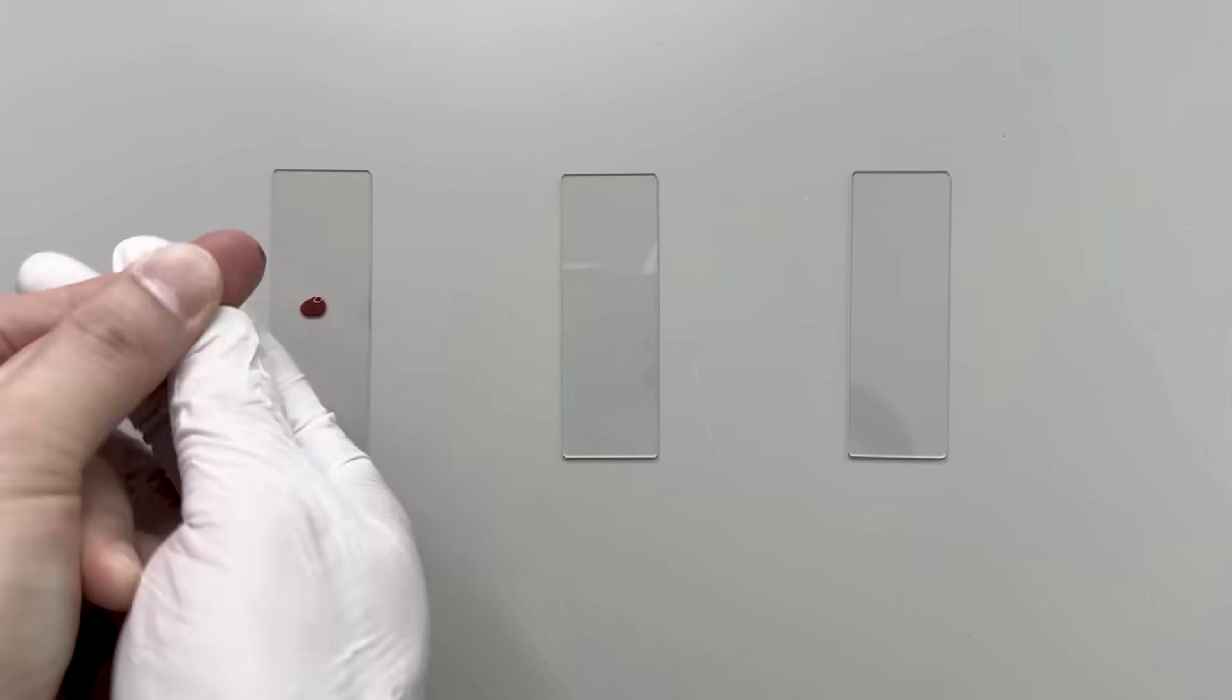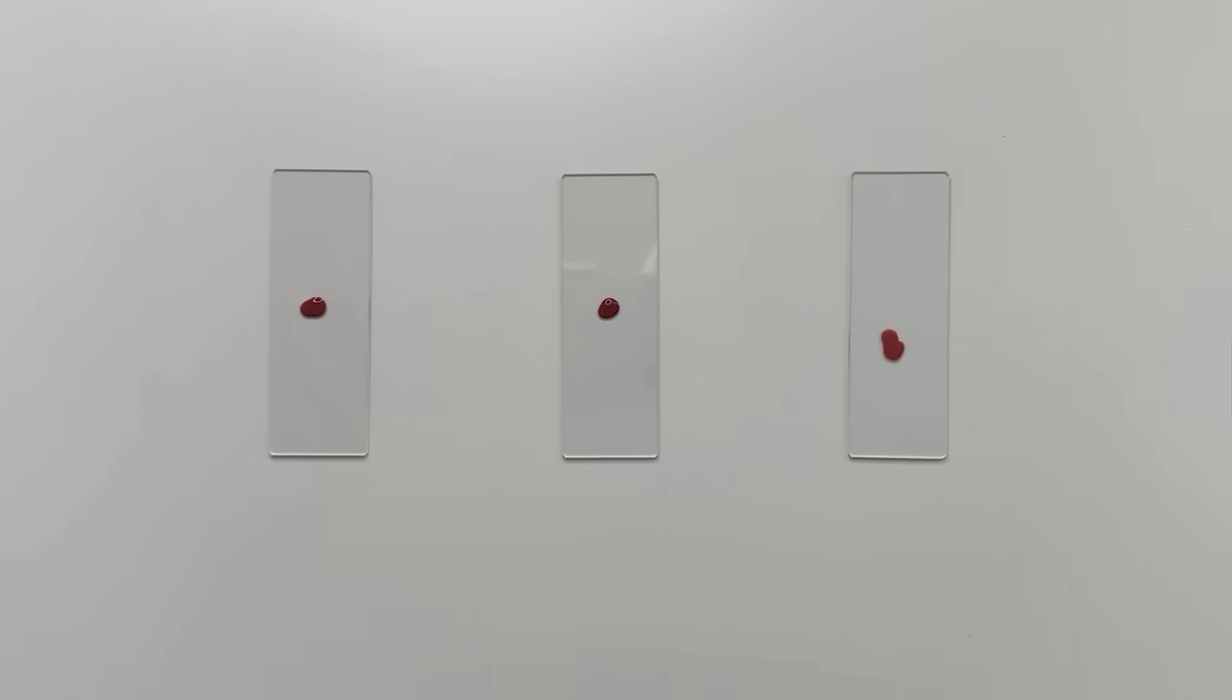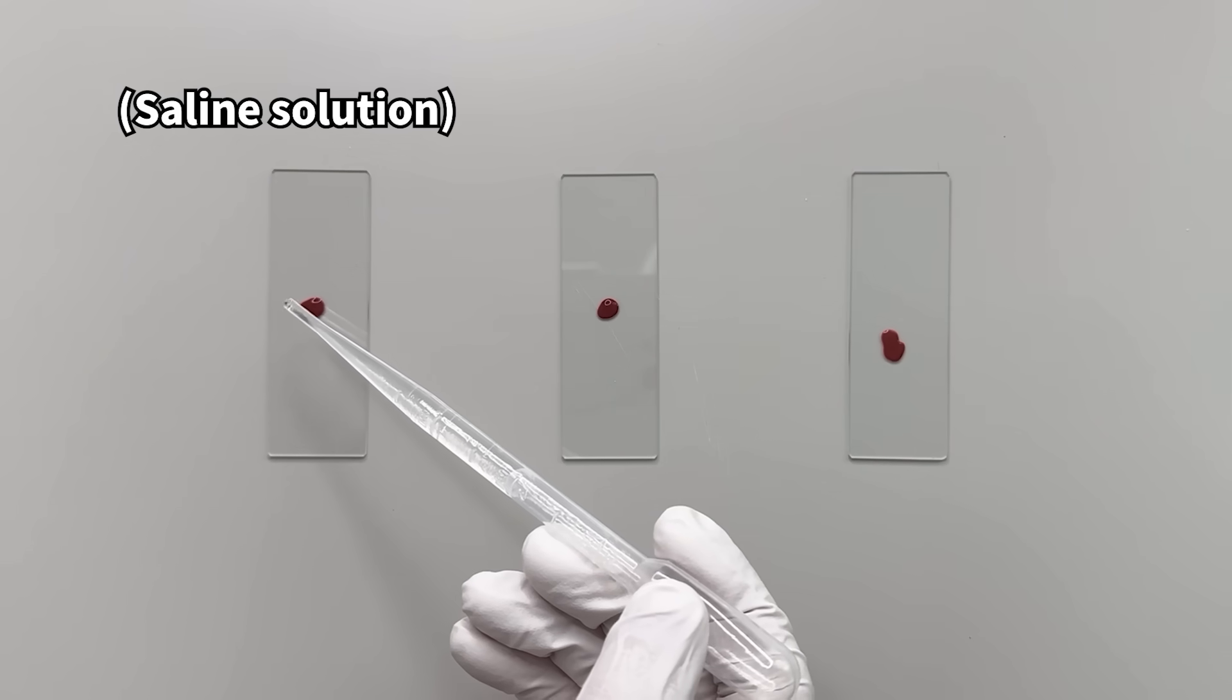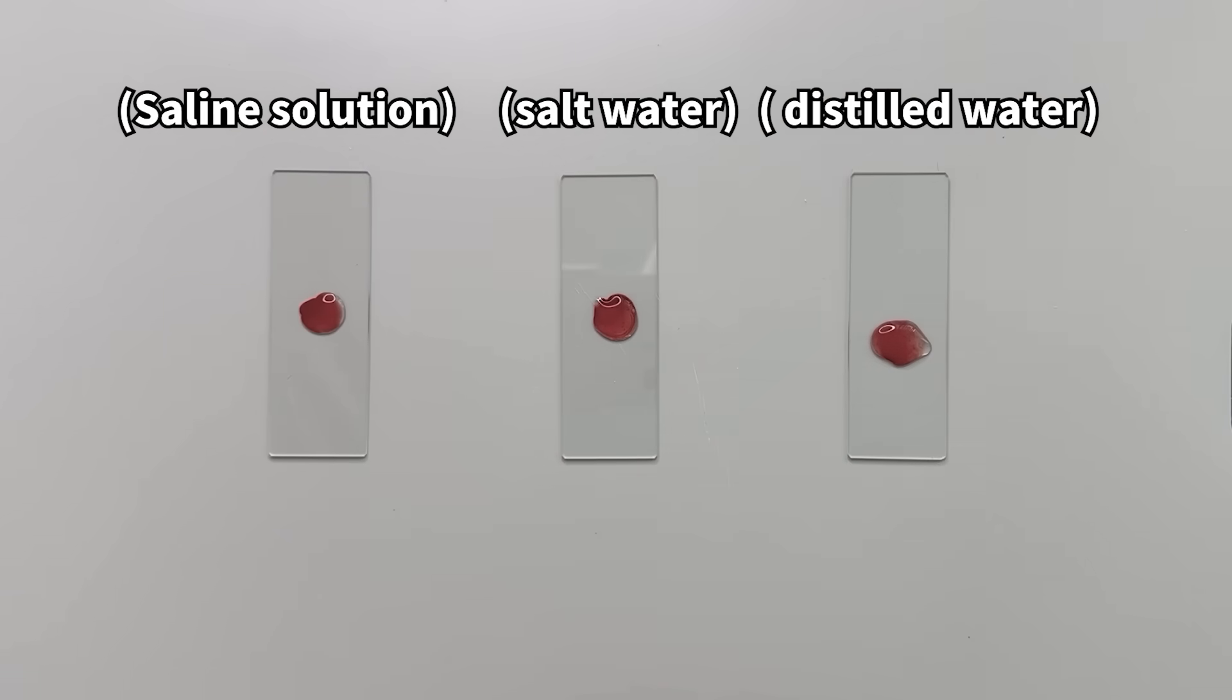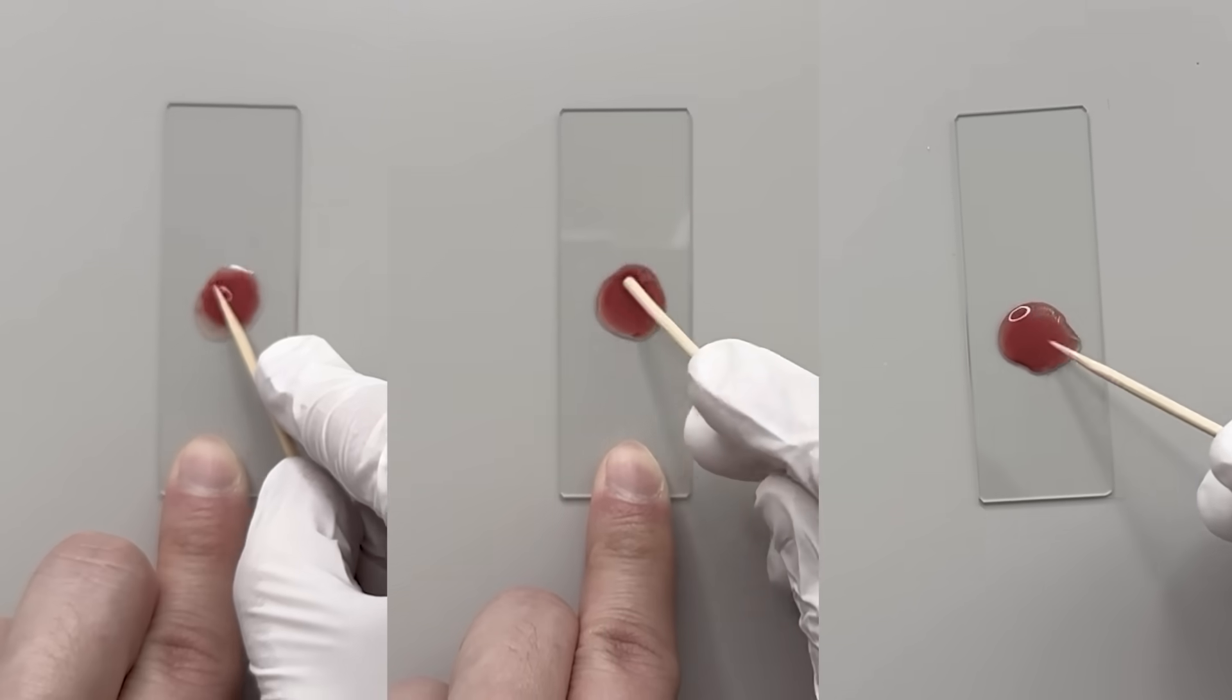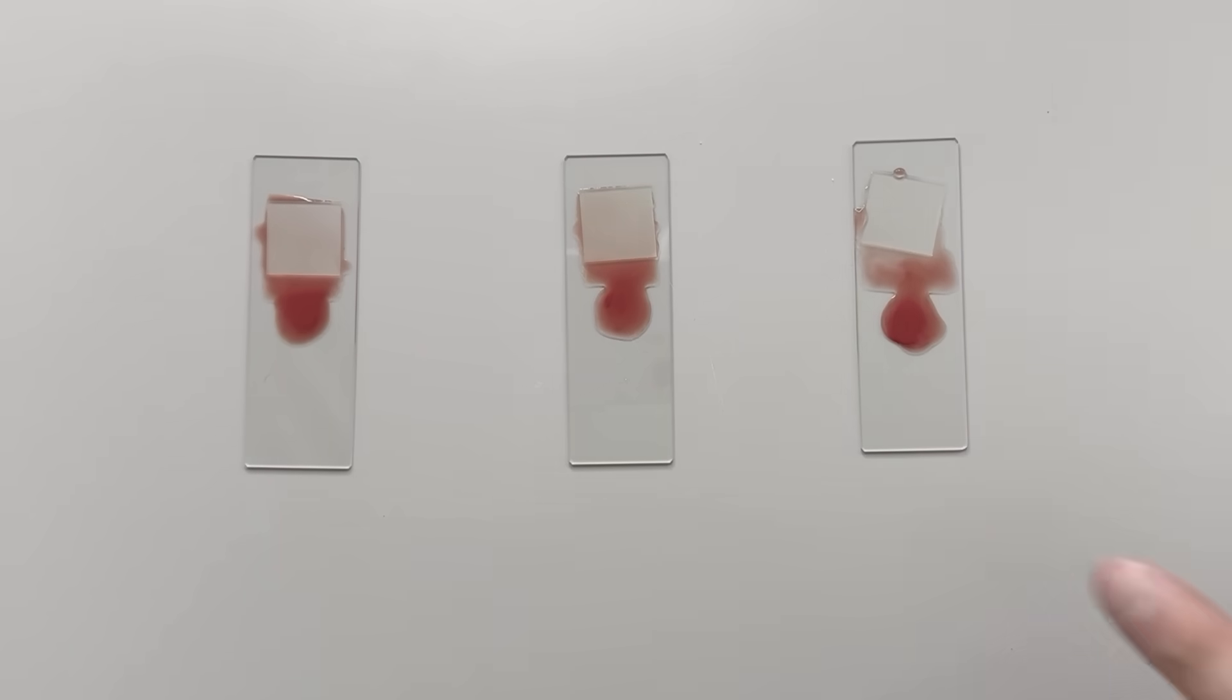I distributed the blood equally among three glass slides. Then I added a drop of saline, a drop of salt water (10%), and a drop of distilled water to each, and mixed them, covering each with a cover glass.